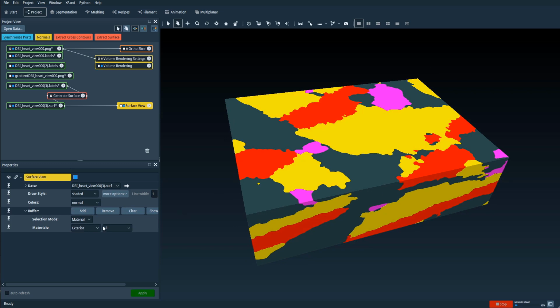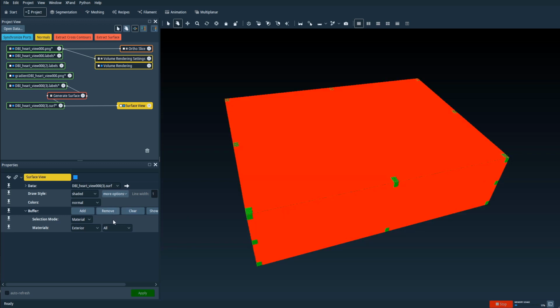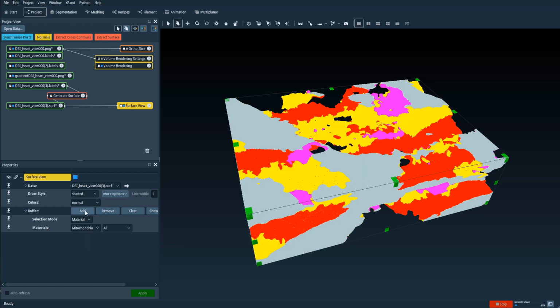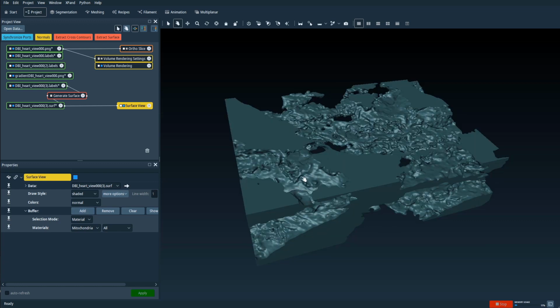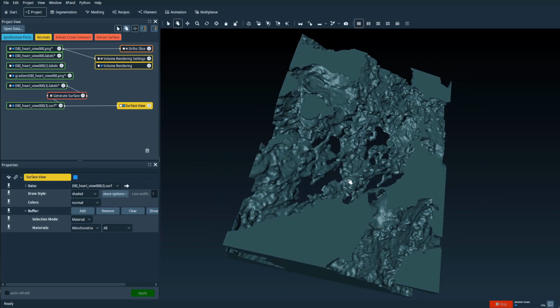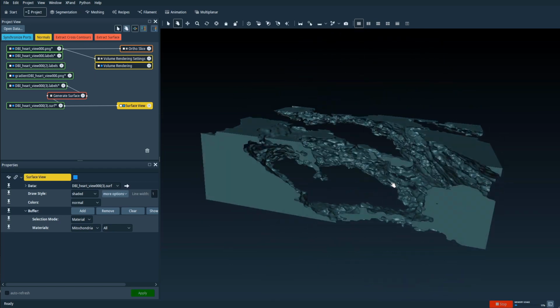Okay, cool. And finally, let's just have a look and focus on the mitochondria. As you can see, that looks really nice.